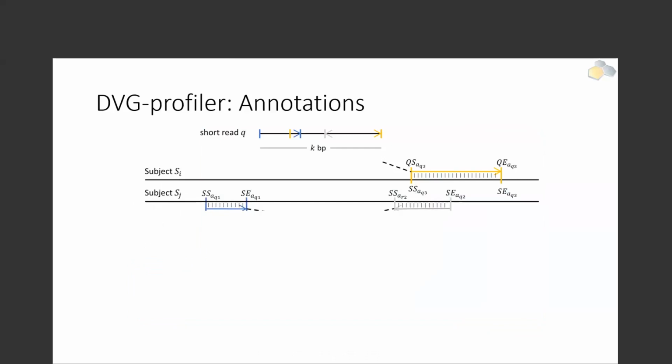So just to give you a more schematic description of what's going on, and that will help us navigate the interface of HIVE and see how one can perform this workflow through the platform. The whole concept is that you have these short reads from one of the sequencing technologies, and you align them to your reference genome, called the subject here.